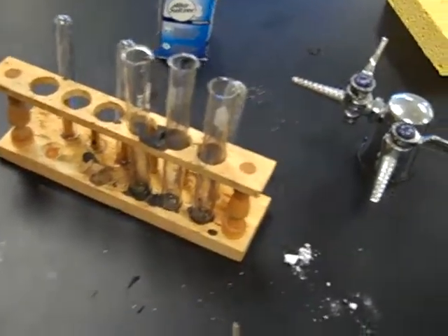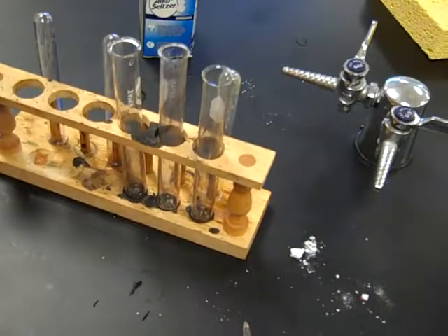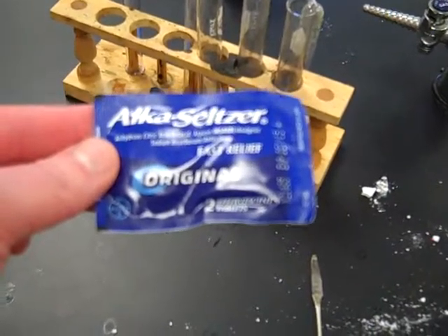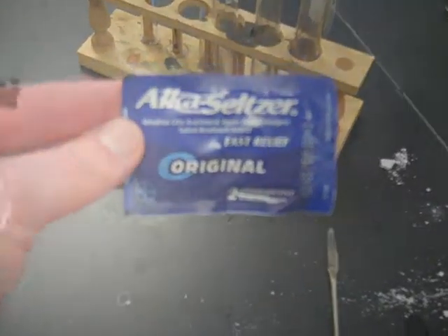Alright, station 4, we're going to put some tap water into a test tube, and then we are going to add a very small amount of crushed up Alka-Seltzer. Okay, we'll be back to video what happens when those 2 substances mix, here in just a second.